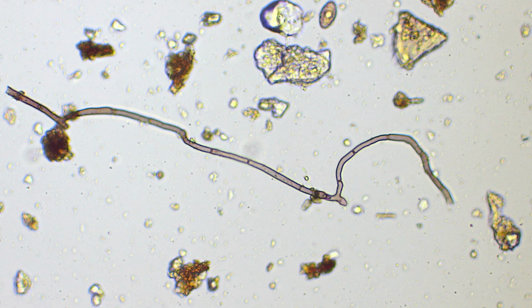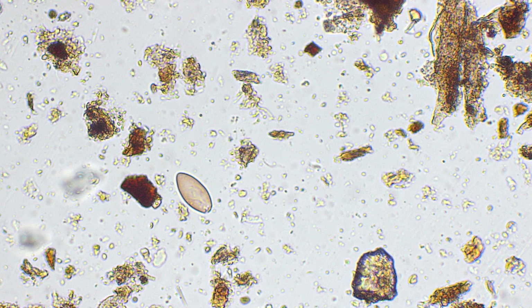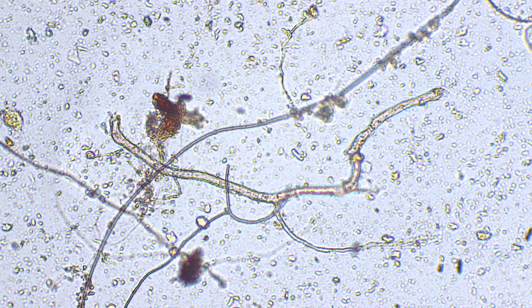They are also distinguished by their septae, or internal cell walls, which look like tick marks and demarcate individual cells. You may also find fungal spores, which can appear as small, dark ovals, almond shapes, or even boomerangs. Fungi grow slowly, and their networks are easily disturbed, so their presence indicates a more mature and undisturbed ecosystem.